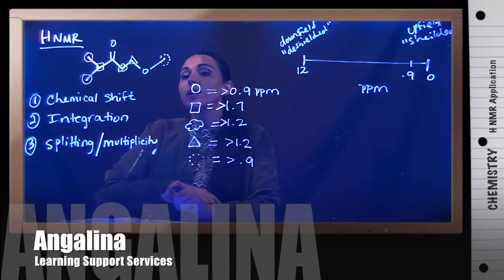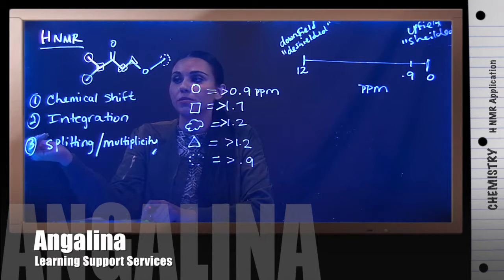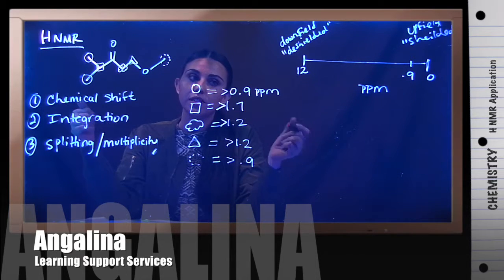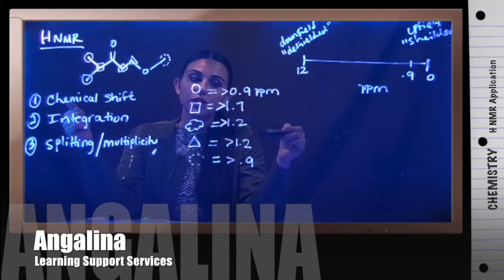We could calculate almost exact values for these, but most of the time we're going to be looking at an NMR spectrum that's already given us chemical signals. So the best thing that we want to do is match the signals that we were given to the signals that we're predicting. So we should expect similar signals to this.